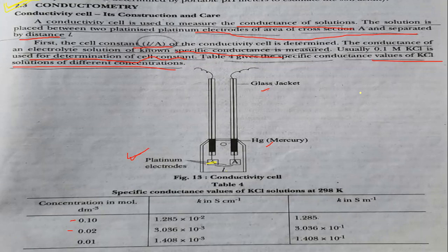The cell constant of a conductivity cell is first determined. The conductance of an electrolyte solution of a known specific conductance is measured. Usually 0.1 molar KCl is used for determining the cell constant. The table given below gives the specific conductance values of KCl solution for different concentrations.